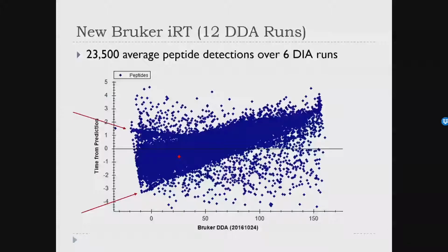when I do that scoring that Ben was talking about, retention time just isn't a very powerful score because of this effect, right? It's not aligned on my predictions. And then I was like, well, what the heck are these things? It looks like a rocket ship, right? About to take off.